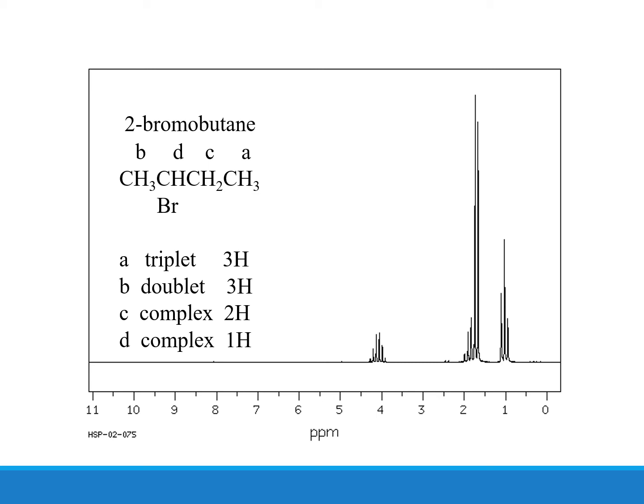The A protons, which means the methyl groups, are the less deshielded protons that appear as a triplet to the right side of the spectrum. So nothing is so unique here. Simply we are trying to see the splitting in different structures and different conditions, right?